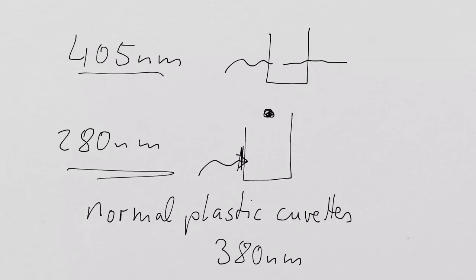Now, one more thing, like Apple, one more thing. When we measure these things in a spectrophotometer, which we will discuss the week after next, we very often look at how much the absorbance is. Again, we know absorbance is C times D times the extinction coefficient.